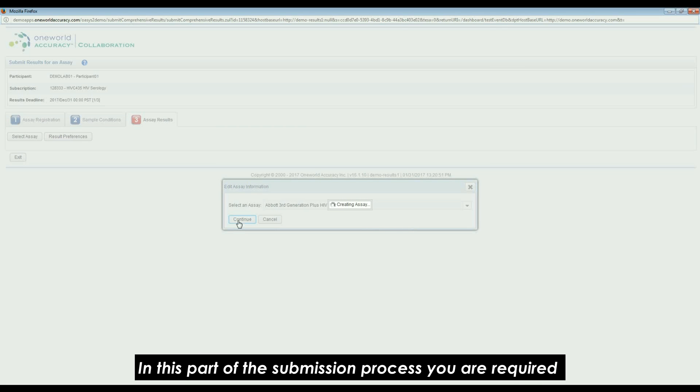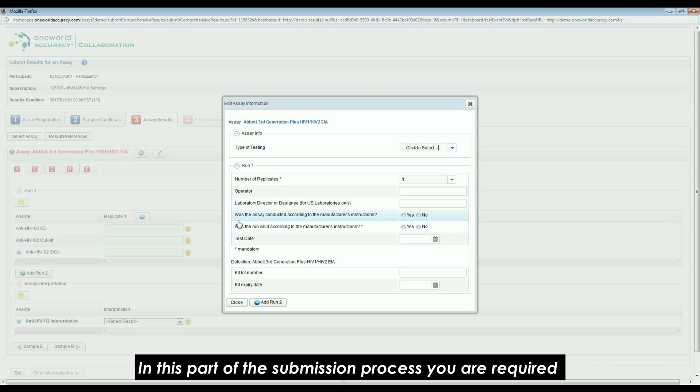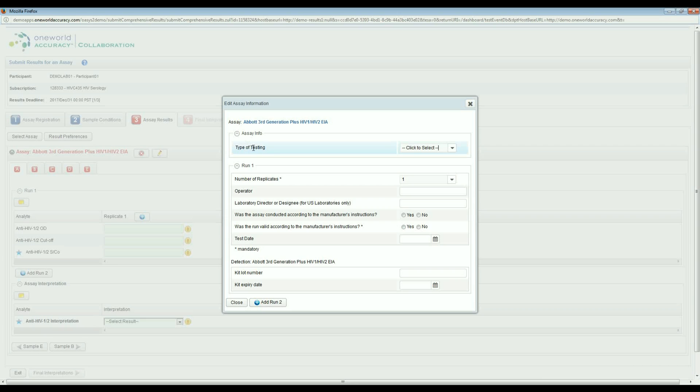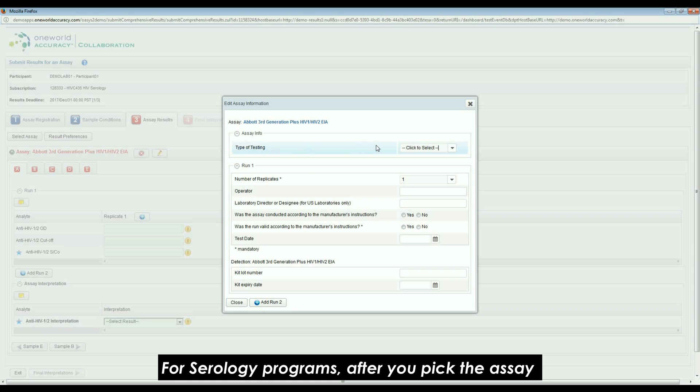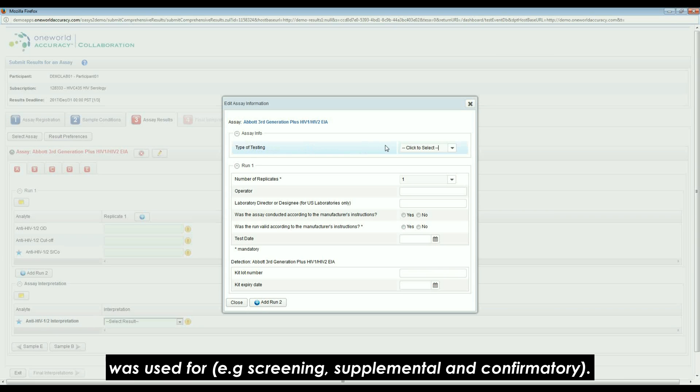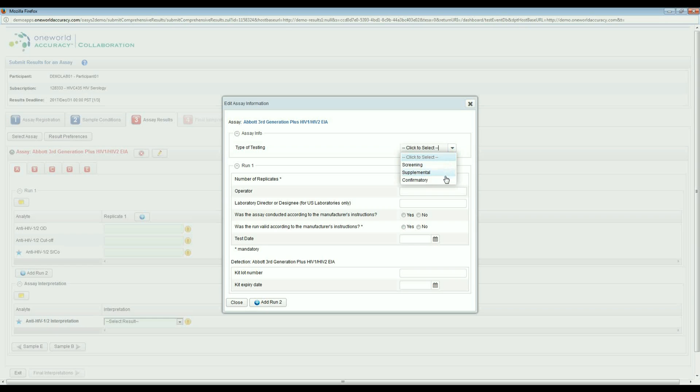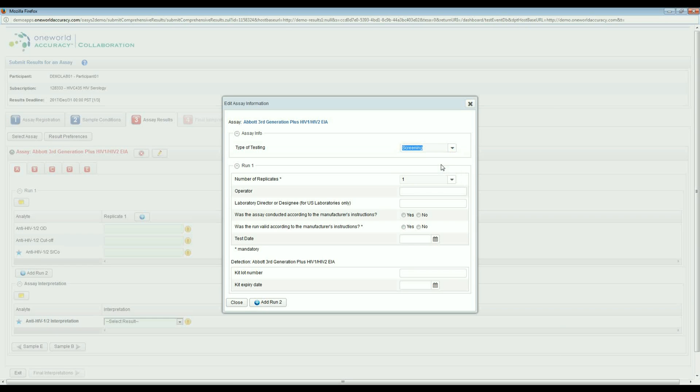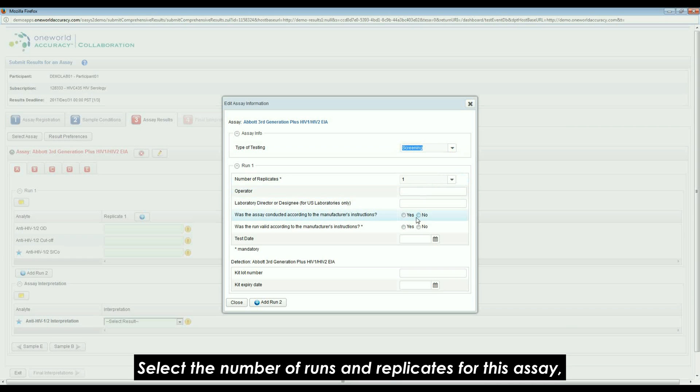In this part of the submission process, you are required to give the information regarding the assays and their respective runs. For serology programs, after you pick the assay, you must choose the type of testing that the assay was used for. Example: Screening, Supplemental, and Confirmatory. For NAT programs, the type of testing is not required.